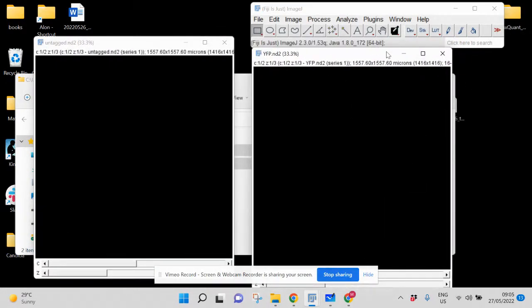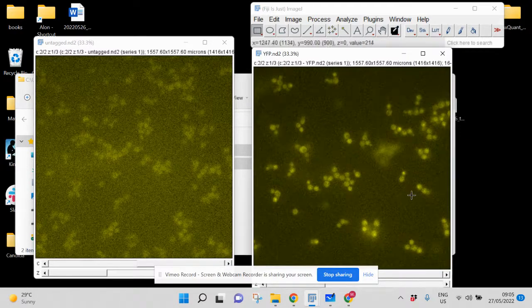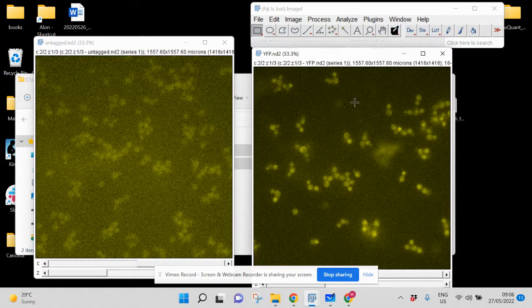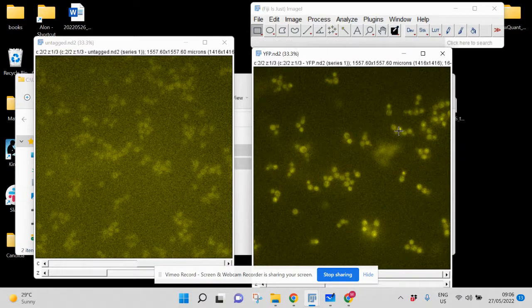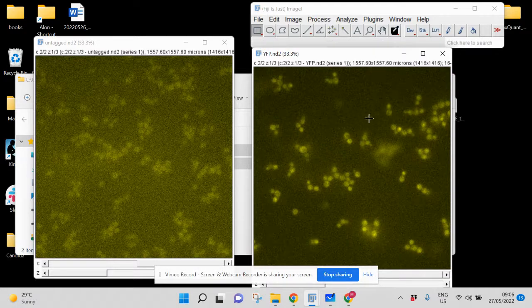Once we put the images side by side and go into the appropriate YFP channel, those cells actually appear at a pretty similar intensity — what's different is the background. When I mouse over the image, the background value is around 200 in both images, so values that are the same are being displayed differently. The brightest spots in the cells are around 400 in one image and maybe 300 in the other, while cells in the other image are around 200. Note these are 16-bit images.